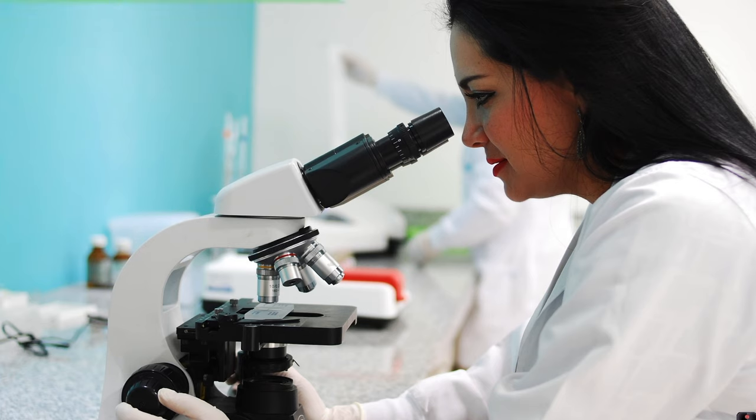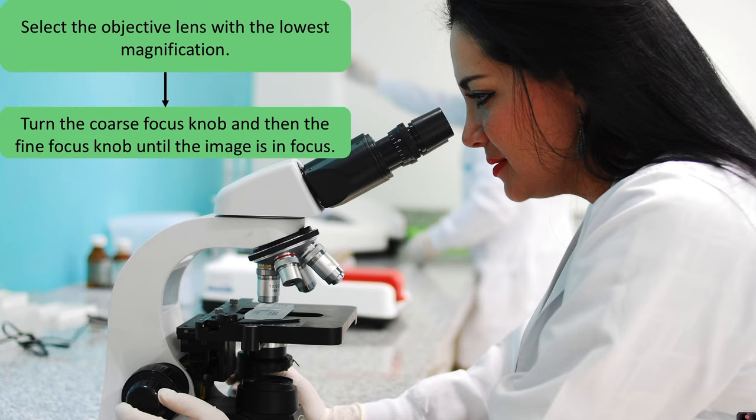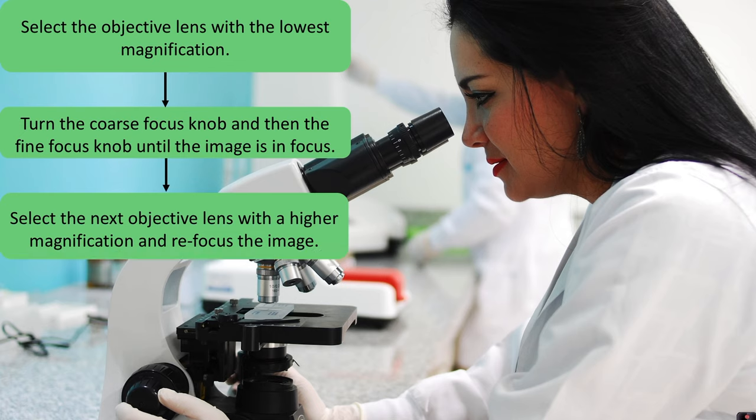In order to view your image you would first select the objective lens with the lowest magnification. Turn the coarse focus knob and then the fine focus knob until the image is in focus. And then select the next objective lens with a higher magnification and refocus the image. And you would repeat this until you can view your object at the highest magnification.